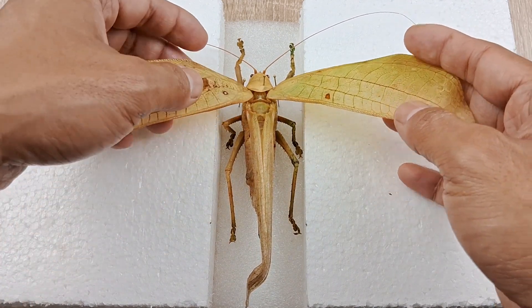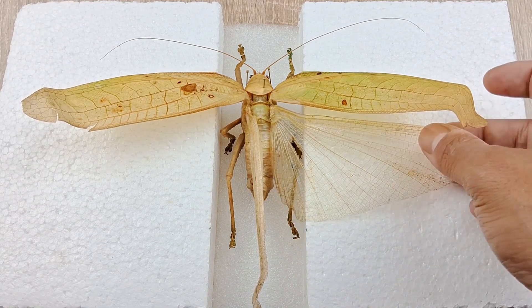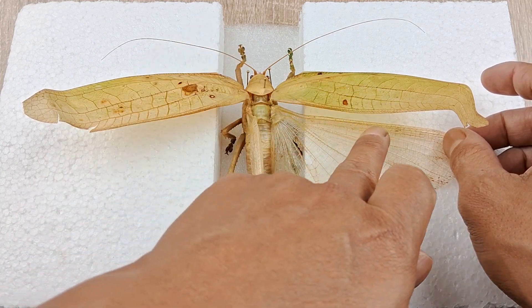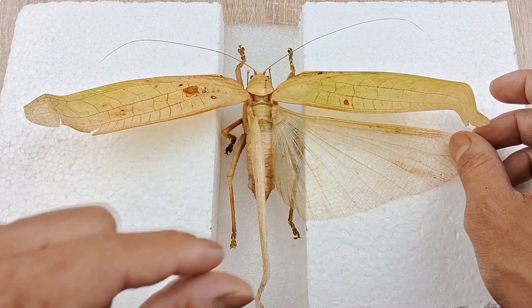Use fixing pins to fix them in position if need be. Next, lift and spread out the hind wings carefully in the same manner as with the forewings. Insert very thin insect pins such as number 1 size pins, one each through the costal vein of both hind wings and fix them in position.